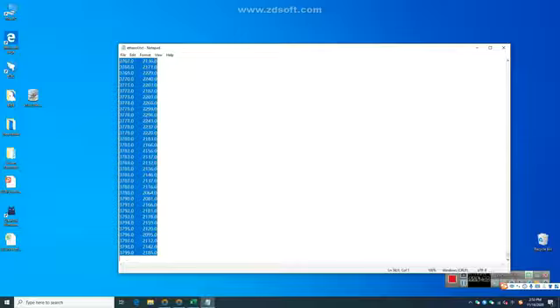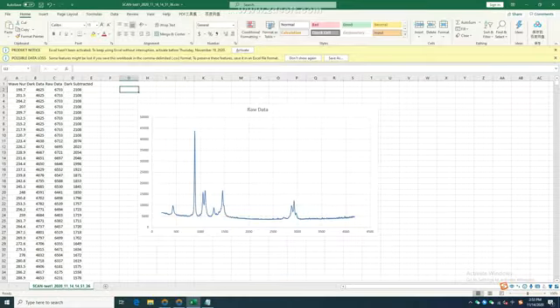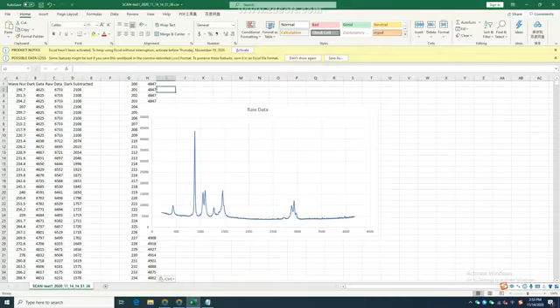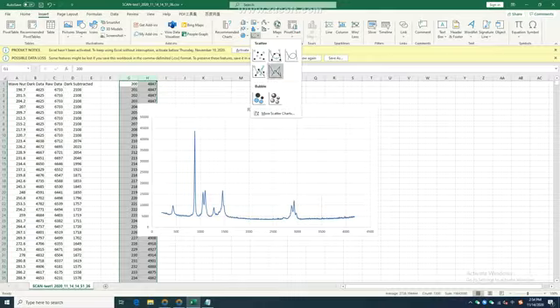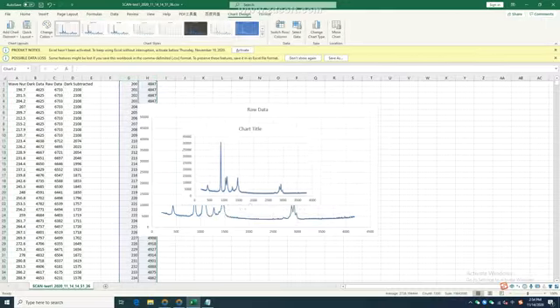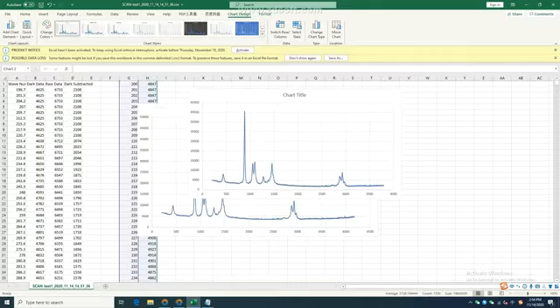Now you have the paracetamol graph in Excel, and then you need to export the spectrum library database of method, and save it in a computer and draft it in Excel.